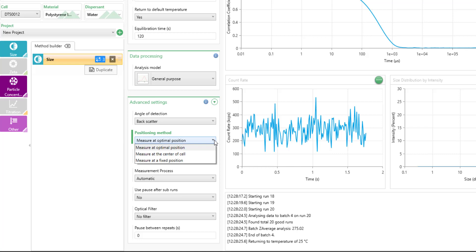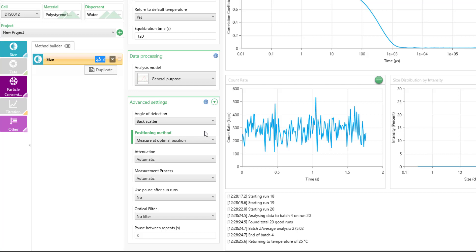The measurement position, typically you would use measure at the optimal position first when measuring your sample. Later, if you're in a QC environment or measuring the exact same sample type, you could actually fix this so that every single sample is measured the exact same way in the same position. What you'll need to do is make sure that if you do that, you're using the exact same concentration range for all your measurements.